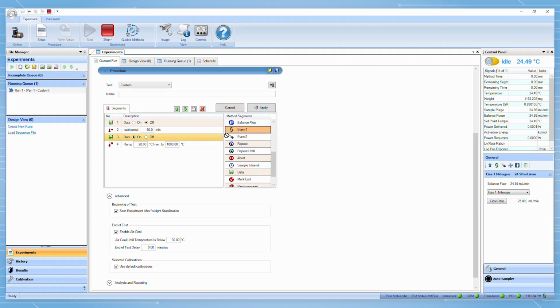When TRIOS data collection begins, you will put an Event 1 on step. This is the trigger for the mass spec to begin the next queued recipe. You want the Event on step to correspond to the beginning of data collection in TRIOS, so that the time points for each data file are aligned.